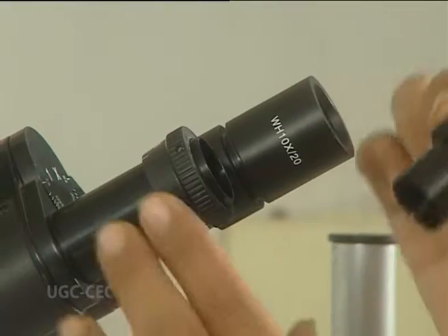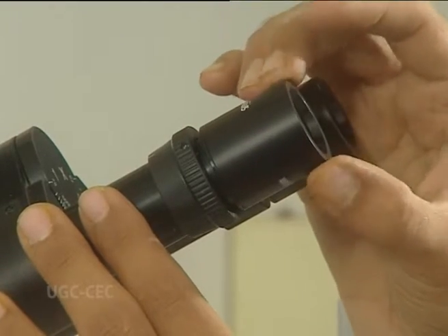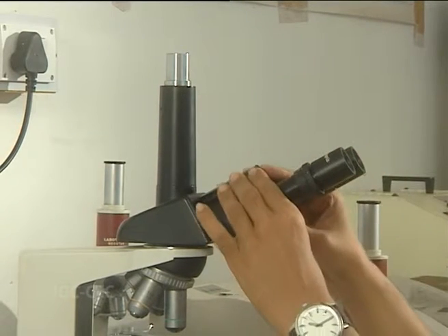Eyepieces. The specimen is viewed through the eyepiece. It has lenses which magnify the image formed by the objective. The magnifying power of the eyepiece is in the range from 5 to 20x. A movable pointer may be attached to the inside of the eyepiece. In binocular microscopes, the two eyepieces can be moved closer or farther apart to adjust for the distance between the eyes by pulling, pushing, motion, or by moving a knurled ring.